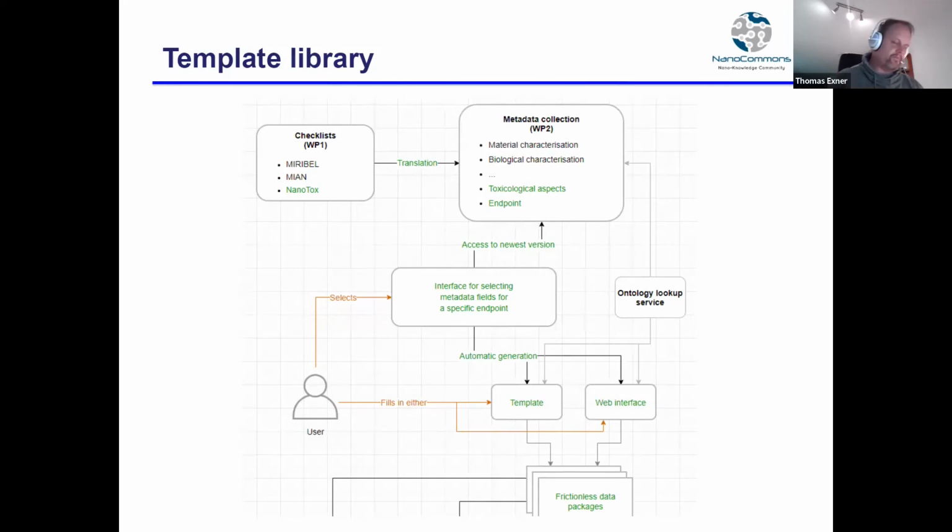These might be the figures, the images of the cells, but it also should mention how you exactly did this experiment. Therefore, we have this translation where we go from something relatively broad to something which is then relatively specific and probably also experiment specific.